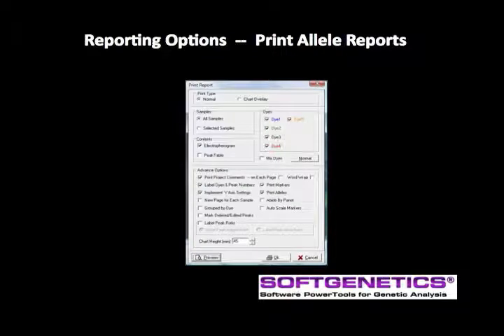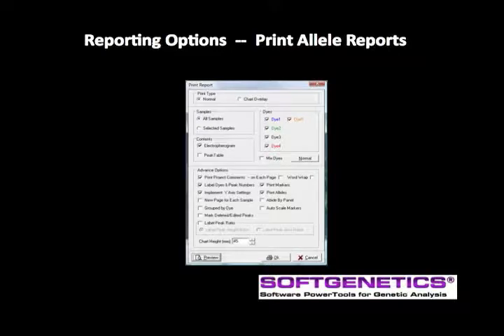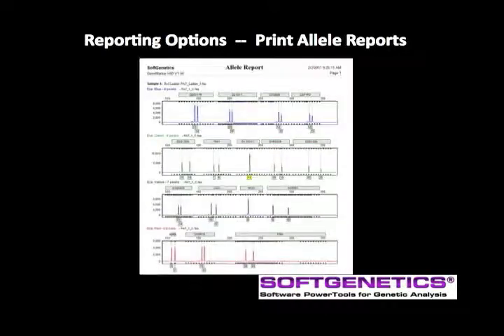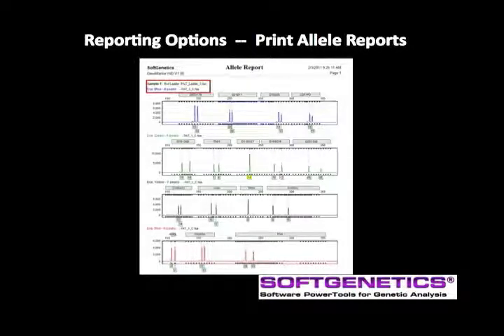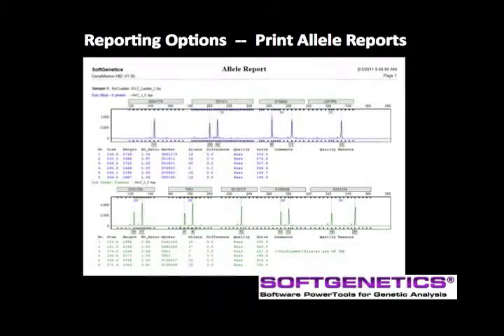Use the printer icon to activate the print report options. Select from a large number of options to customize the print report. For example, selecting these options provides the report seen here with the electropherograms for each dye channel, the sample number, the ladder file selected by the auto select best ladder from page 3 of the Run Wizard, and the sample name and dye listed for each trace. In a second example, the peak table, auto scale markers, and landscape view have been selected.